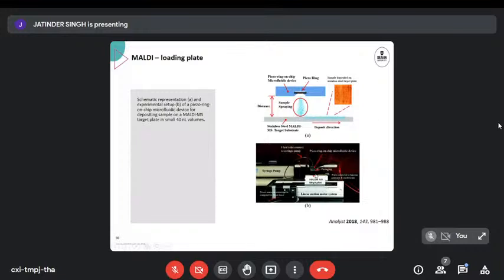And then you can have your MALDI substrate sitting here on a movable stage. For every new separated zone that's coming out of the spray, you move the stage a little bit, and you know the location where each fraction has been deposited. After you've done your microfluidic processing, you take your MALDI plate to the MALDI, screen from one side of the plate to the other, where your different fractions should be sitting, and using a normal MALDI mass spectrometer, you can see where your different fractions have ended up.